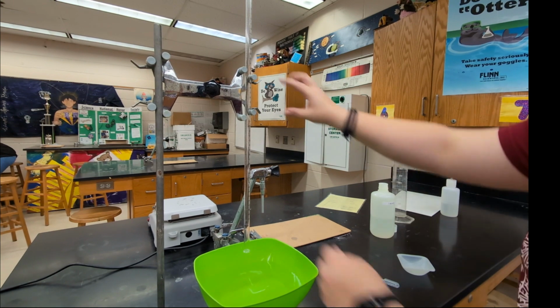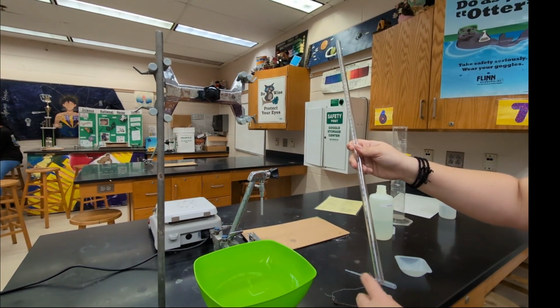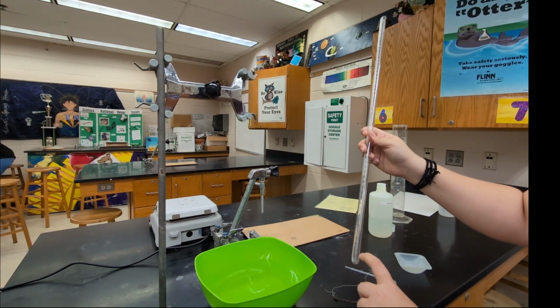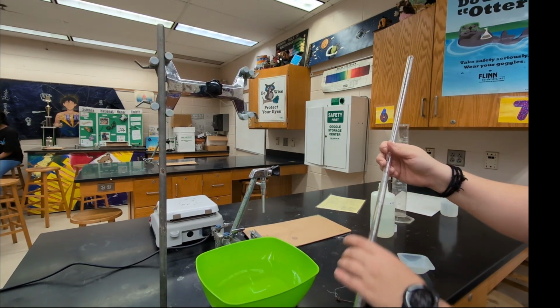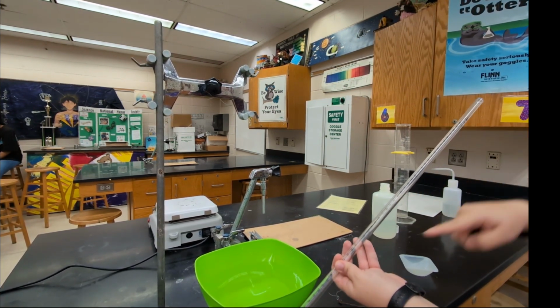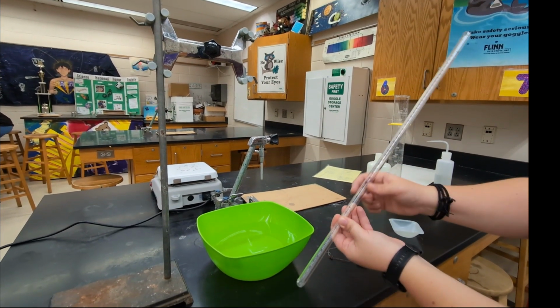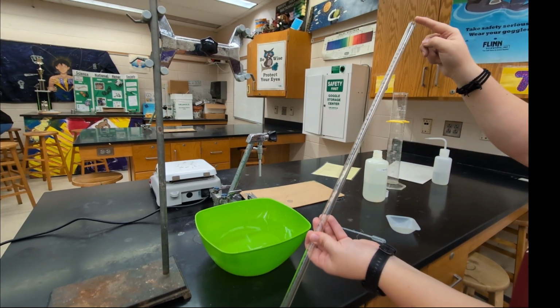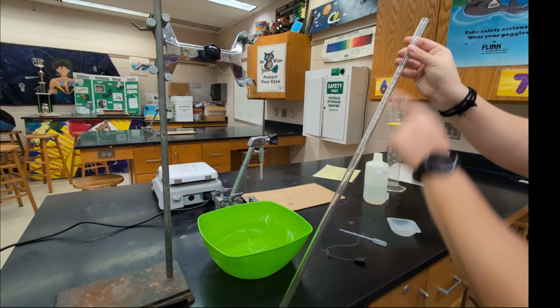What we're going to need to do is then take the eudiometer. You're going to flip it upside down. You want to put about 7 or 8 milliliters of 1 molar hydrochloric acid in the bottom. And then we're going to slowly add deionized water at a slant. The water is less dense, so we really just don't want it to mix. So you want the water to fill up all of the way to the very, very top. So you'll have acid and then water.